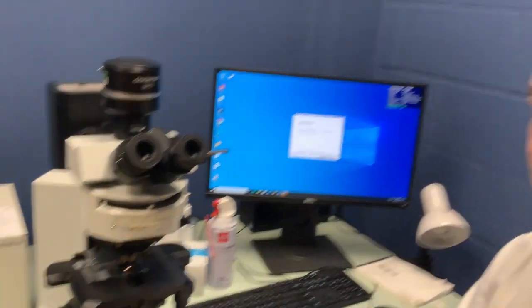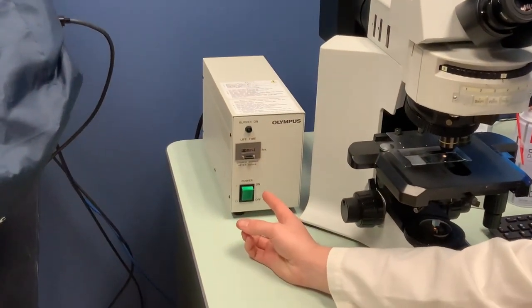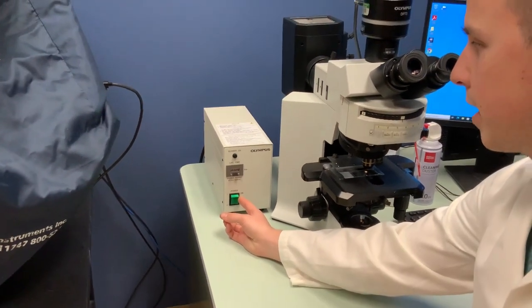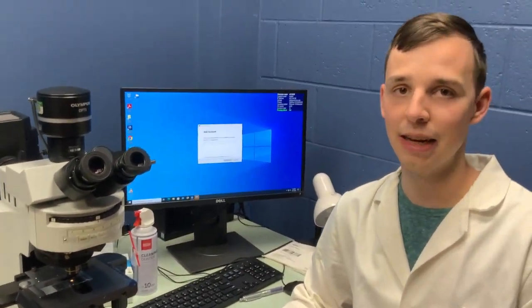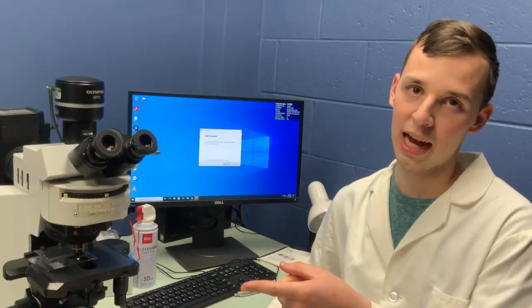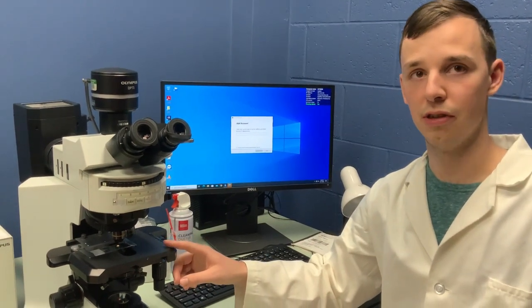For bright field, we don't want those filters in the way. There is a burner over here to do epifluorescent microscopy — you can turn this on to do fluorescence, but make sure it stays on for at least 15 minutes before you turn it off. However, I would recommend that if you're going to do fluorescence, use the Nikon Eclipse, or the older Nikon TE-2000. This would be my last choice for fluorescence.